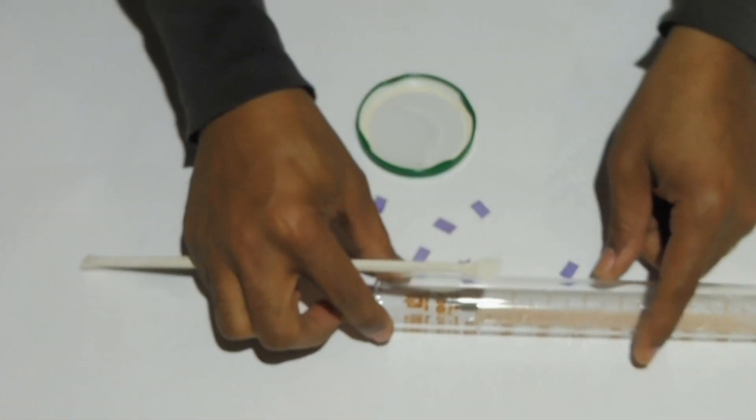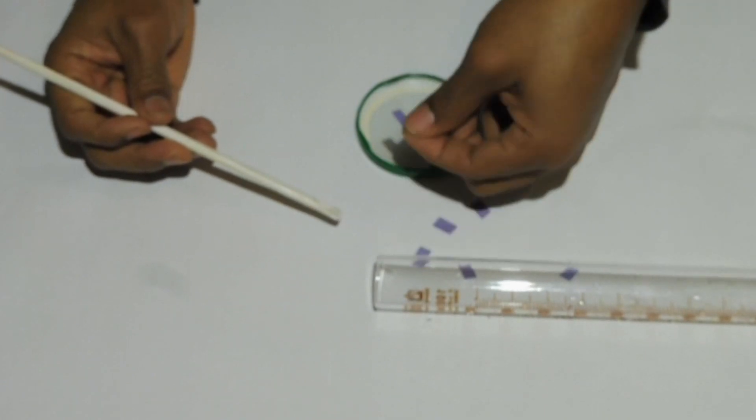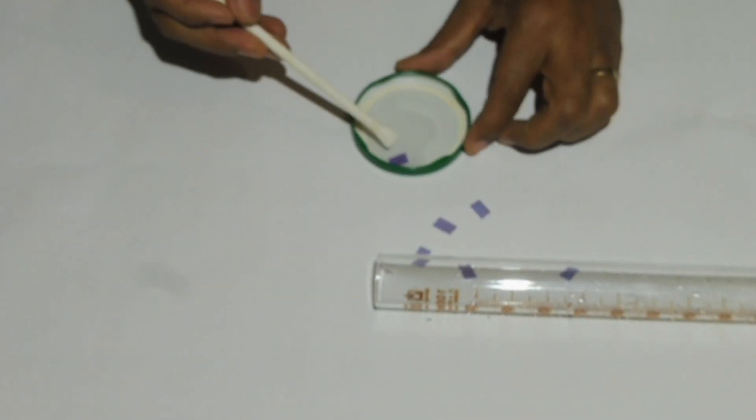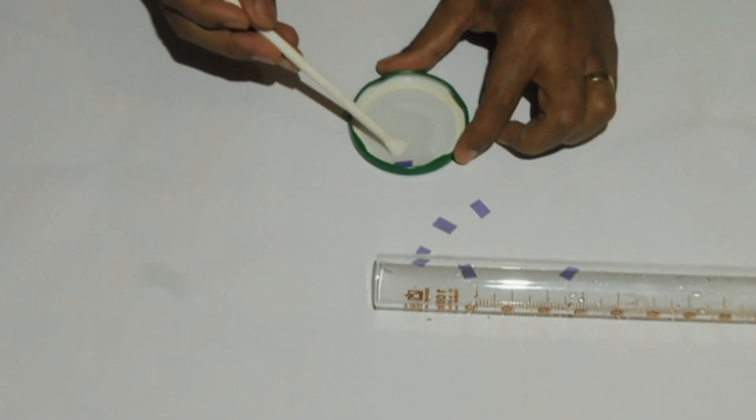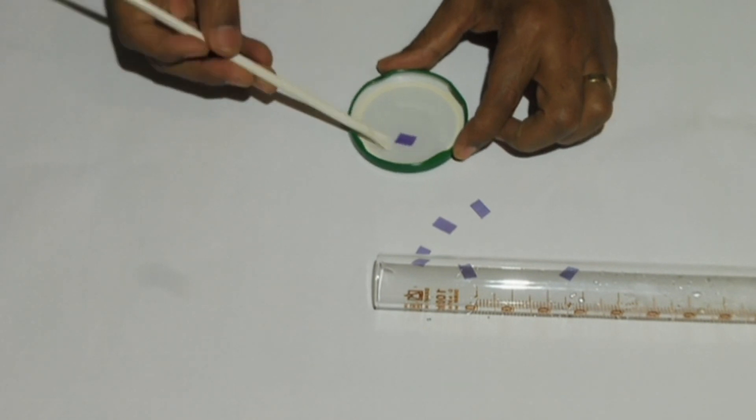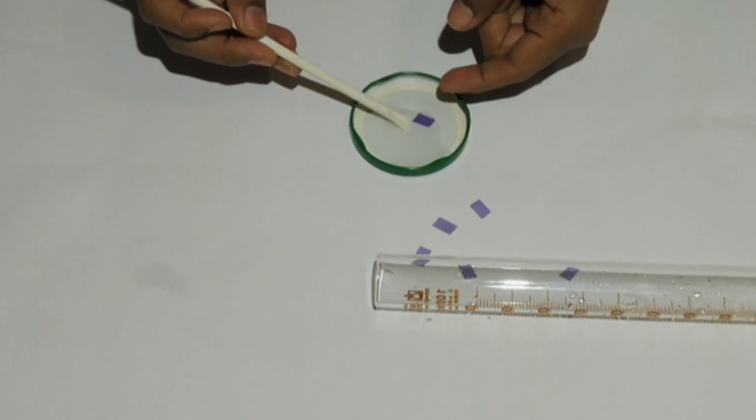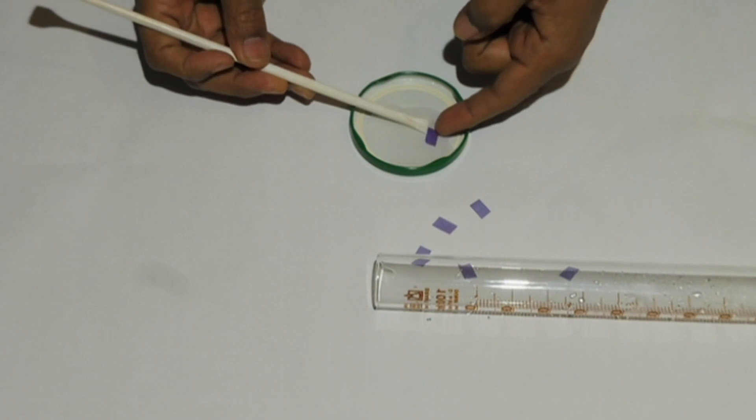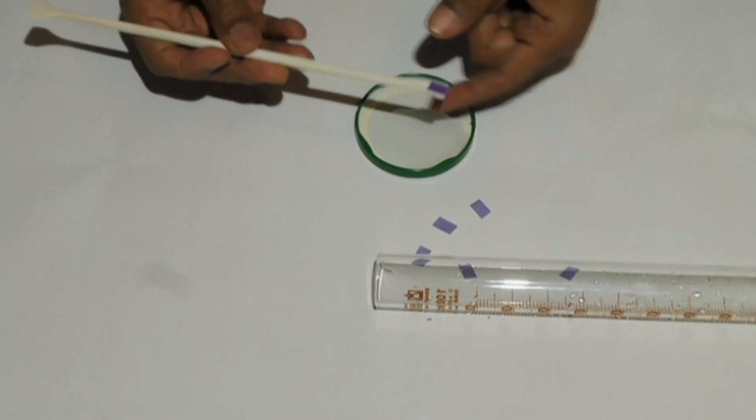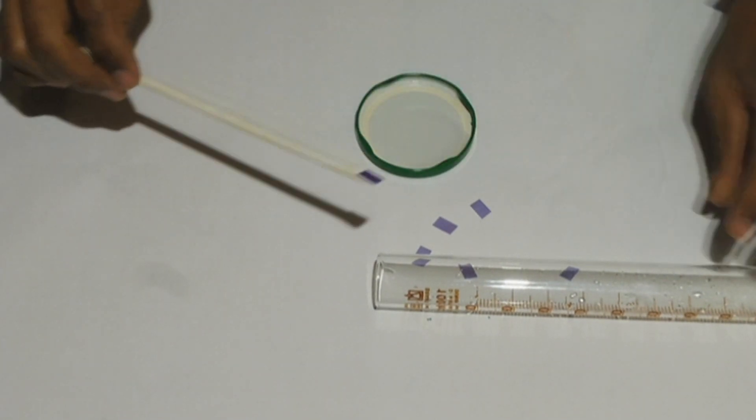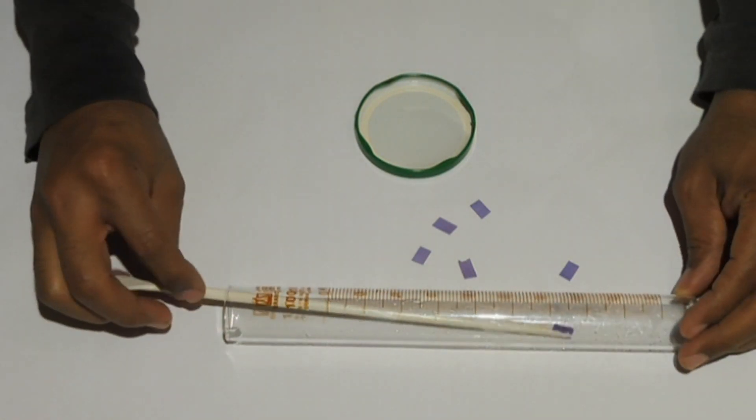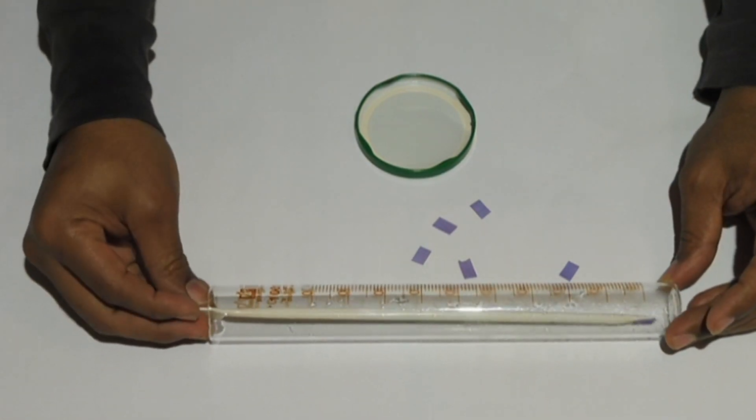I will pick up one piece of litmus paper and dip it into water. Use the stirring rod to take the litmus paper from the water and then slowly insert the litmus paper into the cylinder starting from the far end.